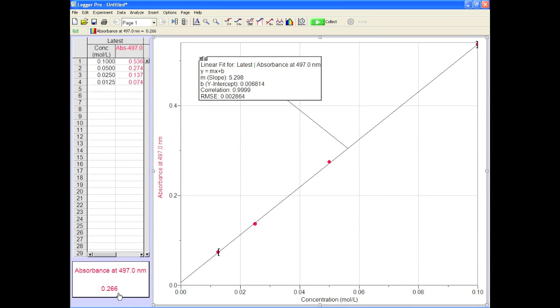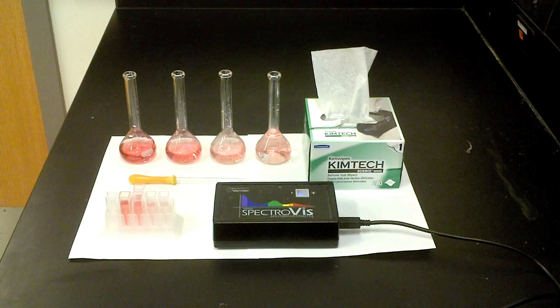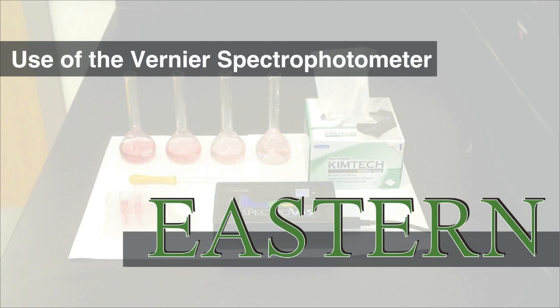Now all you have to do is use your data to find the concentration of your unknown. That's a snap, right? Time to clean up. Now you know how to create a calibration curve using your Vernier spectrophotometer.